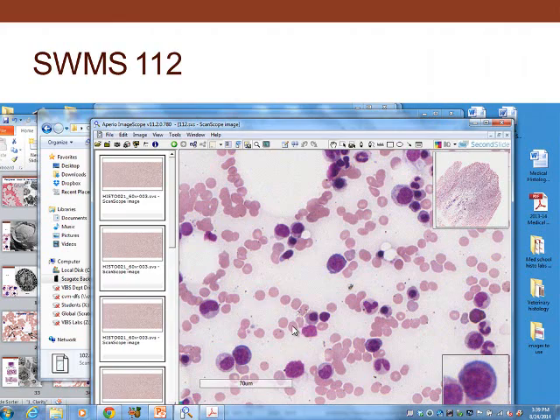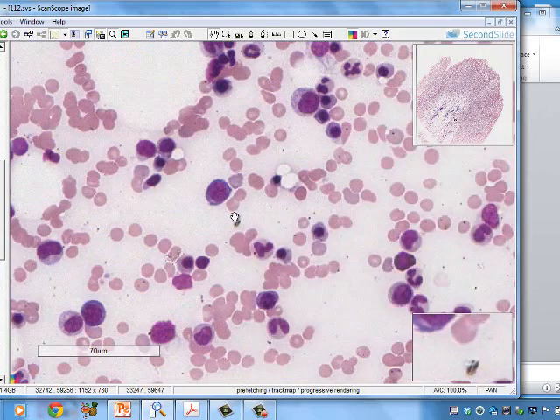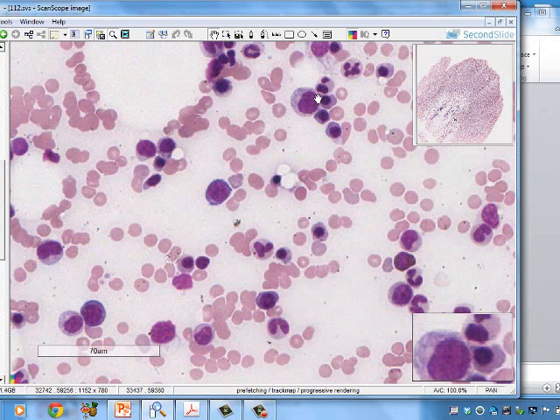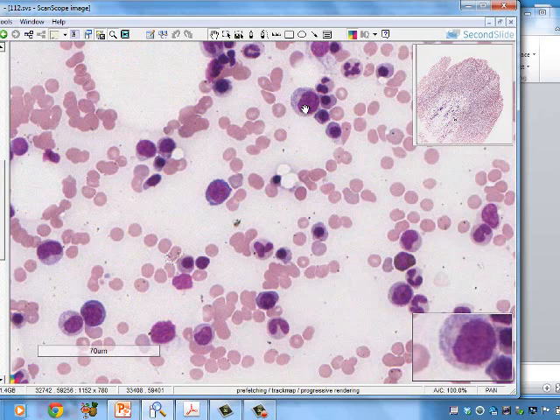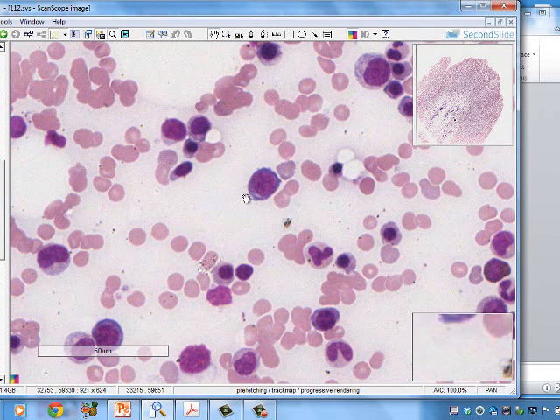So if we take a look at that specimen here, we can see the different things. Is it an oval nucleus or is it spherical? That's the first thing you want to name, because this is going to be in the red blood cell series, and that's going to be in the white blood cell series. So if we look at these, there's an orthochromatic erythroblast, 1, 2 there.